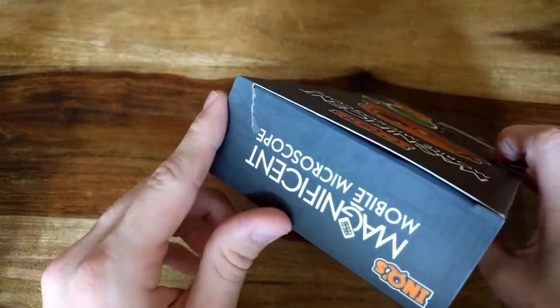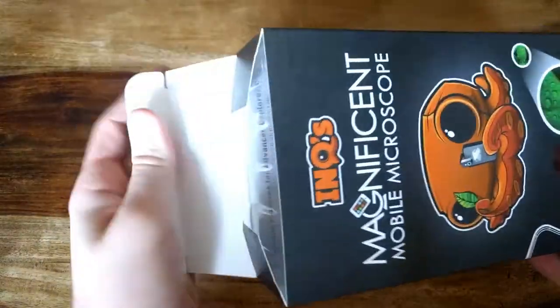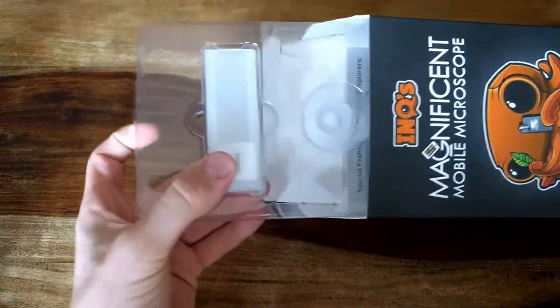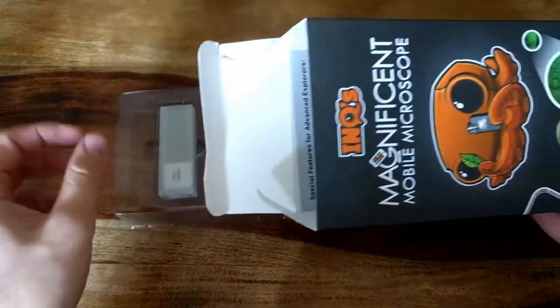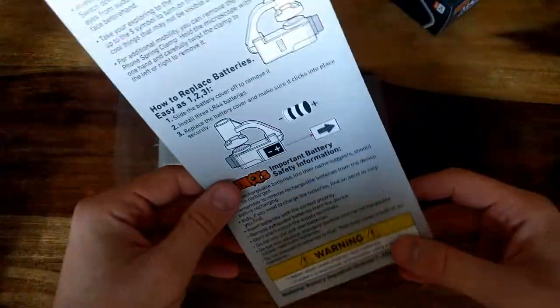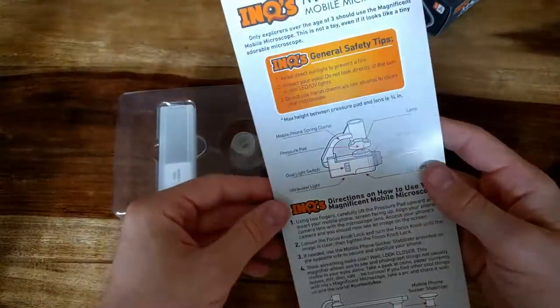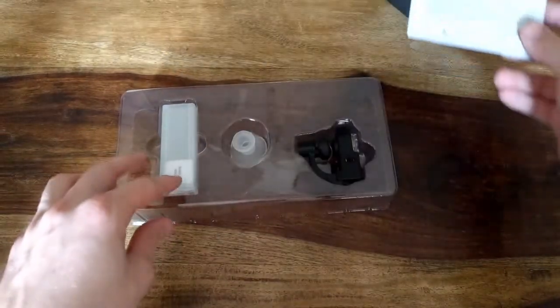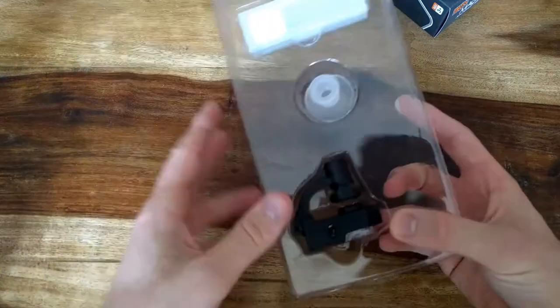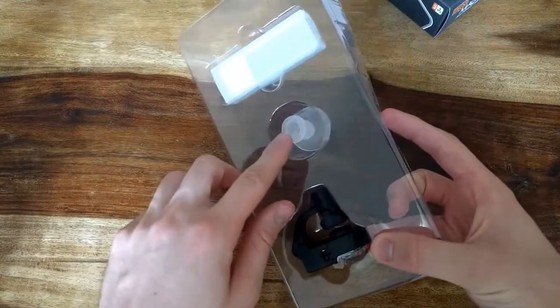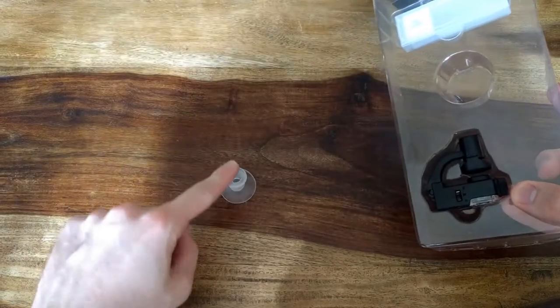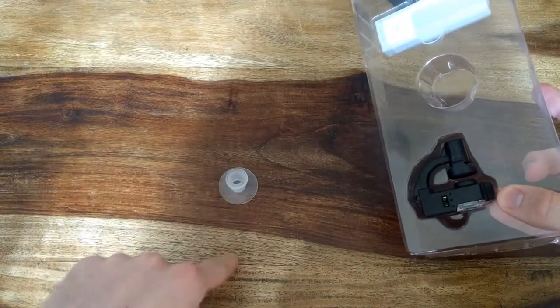Let me pull it out. Let me move the box away, so this is an instruction sheet of what's inside. I already went through it, and this is what you get. This is the microscope itself, this is the stabilizer for the phone, and it has suction.